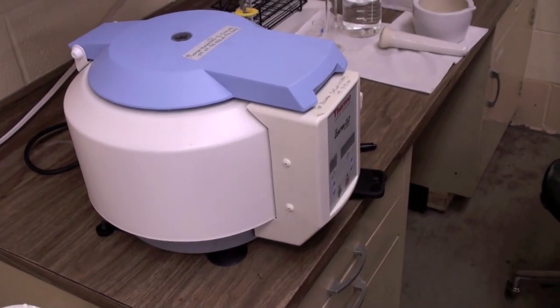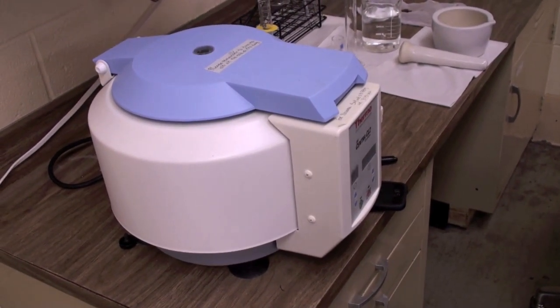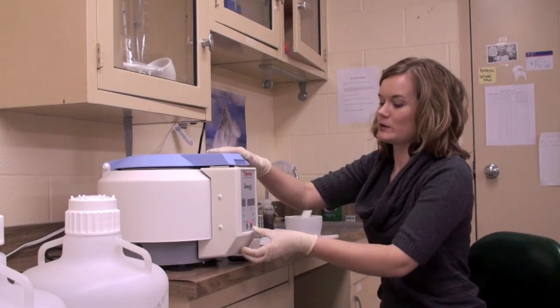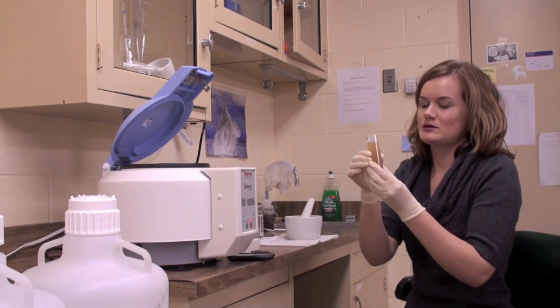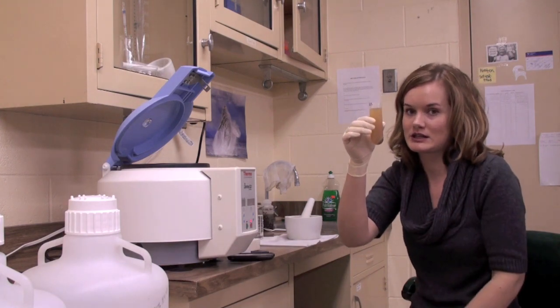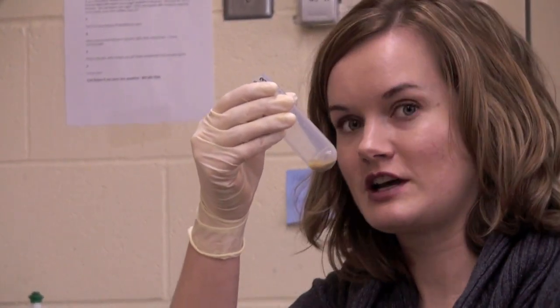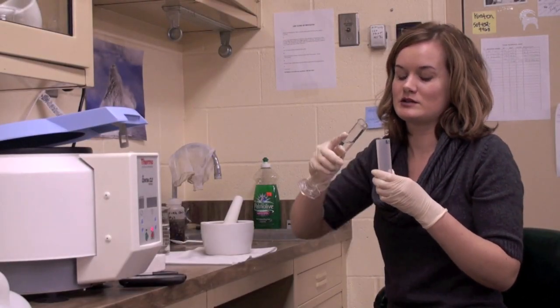Now the centrifuge has stopped spinning. We open it up and take out our sample. All this excess liquid that we don't want, we pour down the sink, and we have this pellet at the bottom — that's what we're going to continue to work with. At this point we're going to add 50 mls of clean distilled water back into it, carefully, because it's now going to be very close to overflowing.